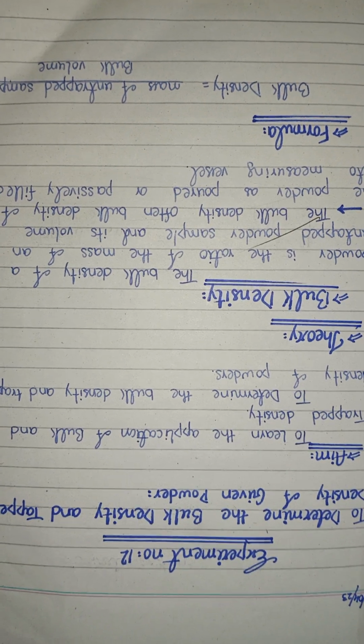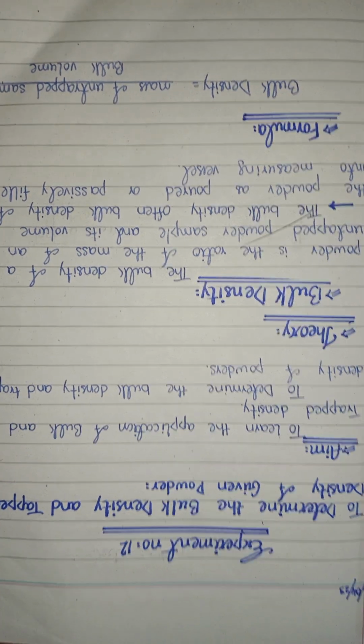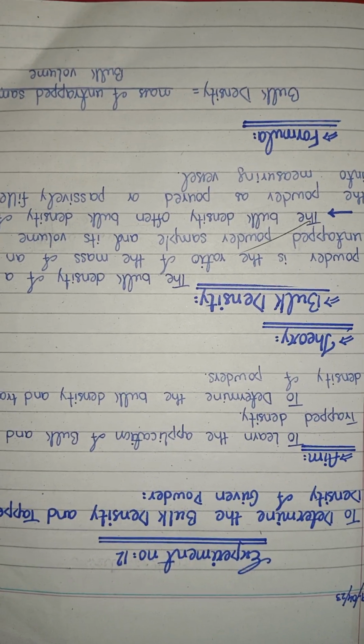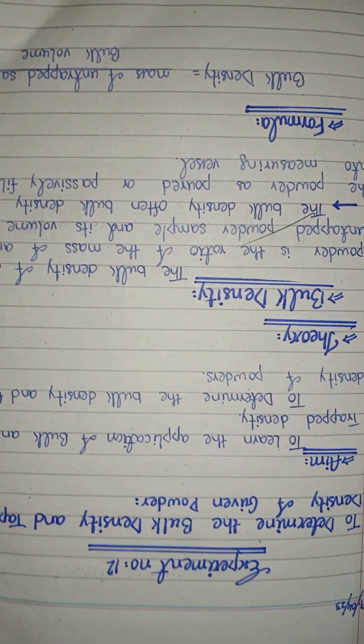Assalamualaikum everyone. In today's video, we are going to discuss experiment number 12, and this experiment is about the determination of bulk density as well as tap density of a given powder.